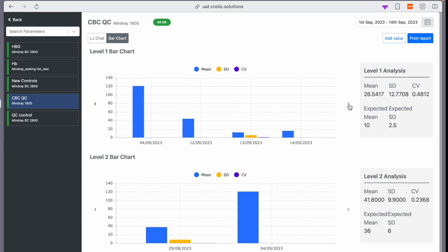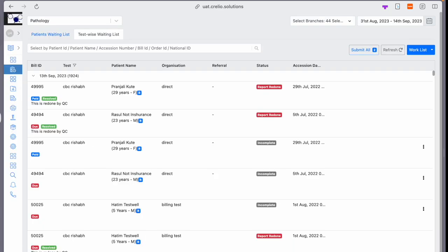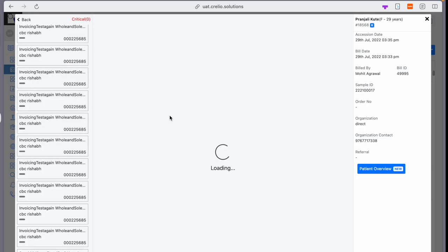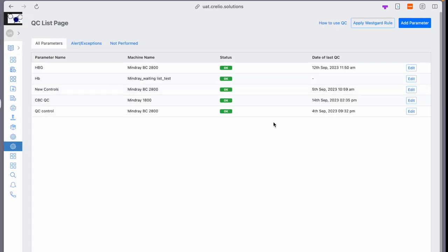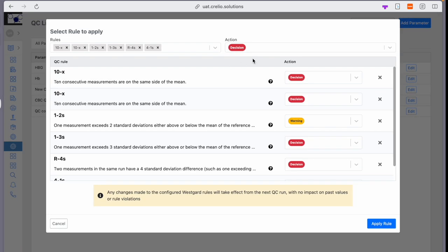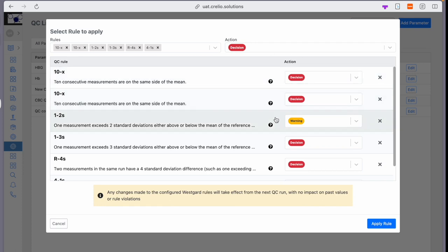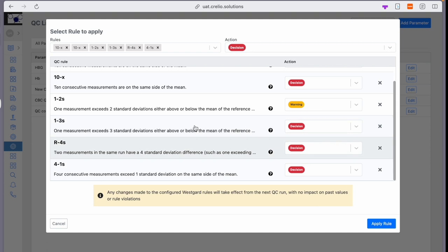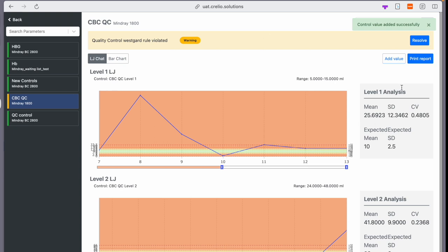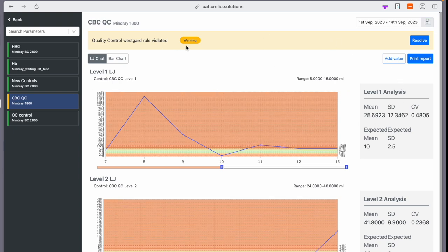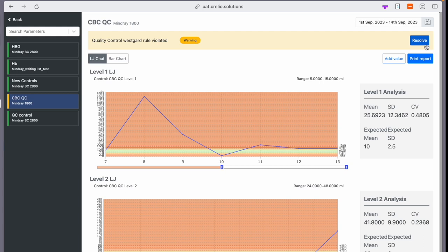The quality control also allows you to see the latest QC values while filling the report for the mapped test. The new QC also has an option to apply Westgard rules, so you can automatically block reports in certain QC rule violations and show warning for appropriate rules. For this level, we enter a value. Now, because this value violated the rule 12S, it shows a warning and gives an option to resolve at the report entry screen.